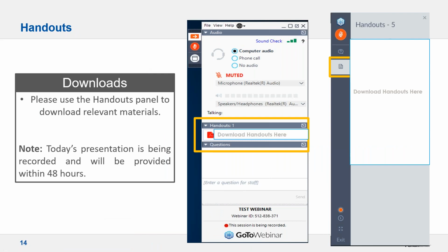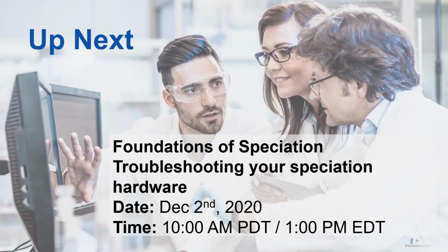Yeah, and that's really kind of what Brady talked about in the presentation. Just try it. Do your background point correction, then run your IEC, run your MSF, and compare the results. See what makes sense. See what works better for your matrix, so for your quality control solutions, for your sample. Right. So do the experiment. Check it out.